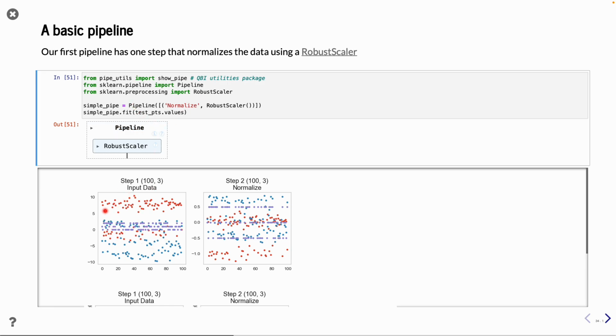So from the beginning we had plus minus 10, and now it's shrunk together because many of these algorithms work best if they have normalized data. In particular, if you have multiple feature vectors, then it's of real importance that you normalize it. Otherwise, one will be very dominant in the training.